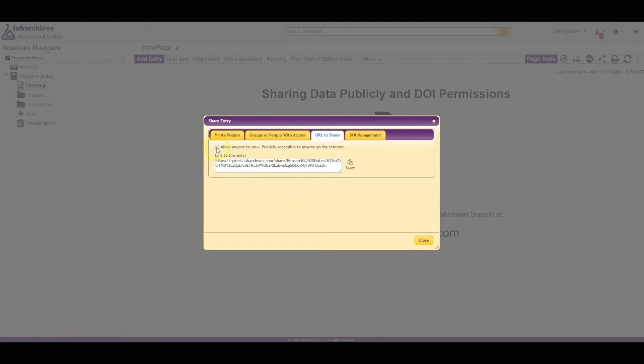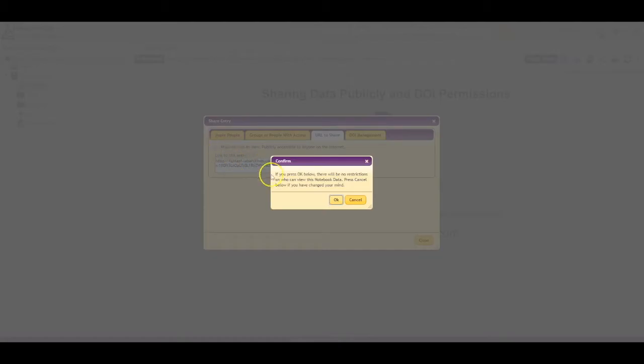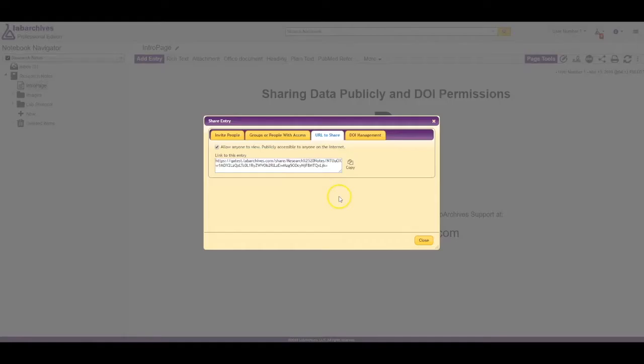If this data is shared publicly, anyone with access to this link with or without a LabArchives account can view it. At any point, you can remove public access by deselecting allow anyone to view publicly accessible to anyone on the internet.